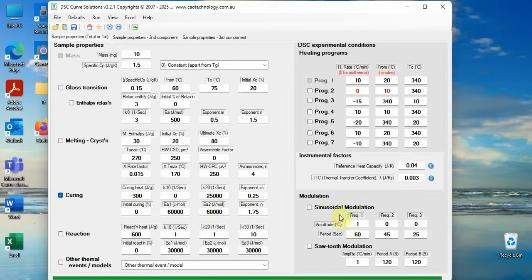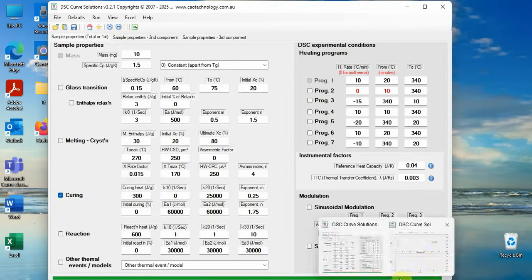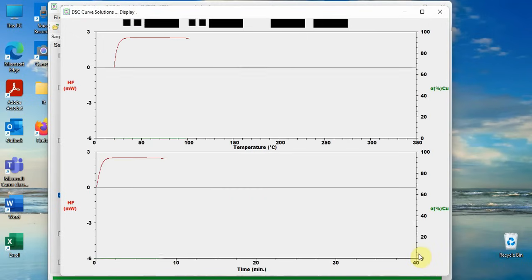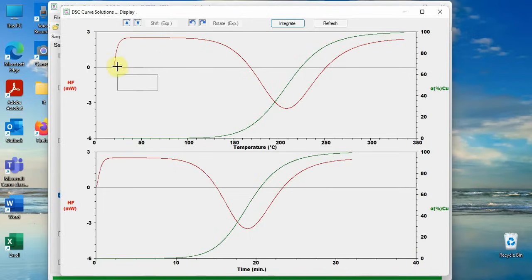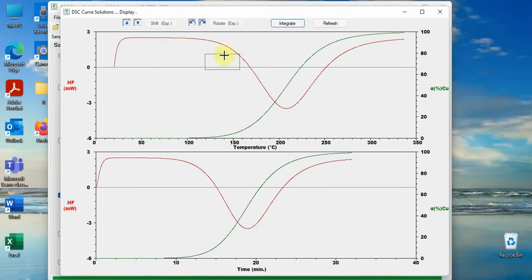The results show two DSC curves. The top one is for heat flow versus temperature, the bottom one for heat flow versus time. The curves start from zero, via a transition period of tail, settle in a constant value. We then see the curing exothermal over this temperature range.